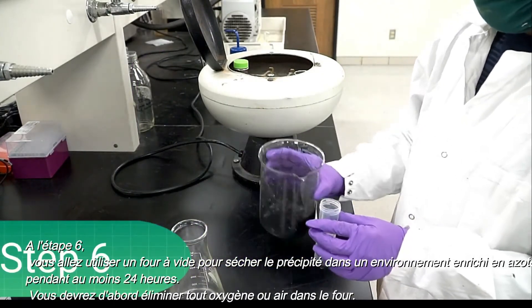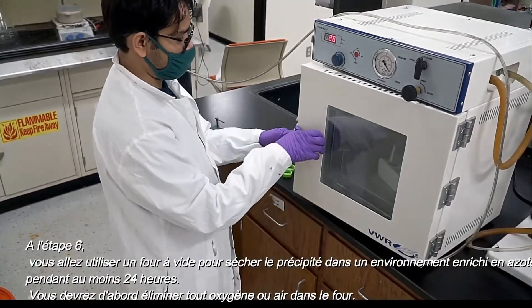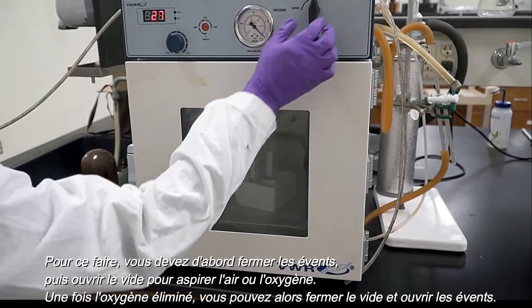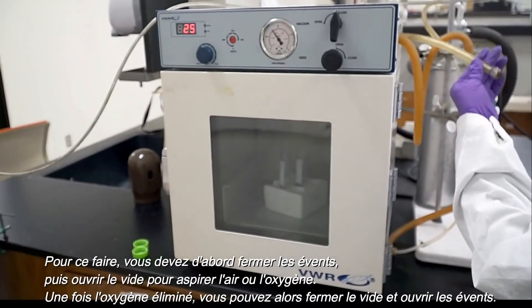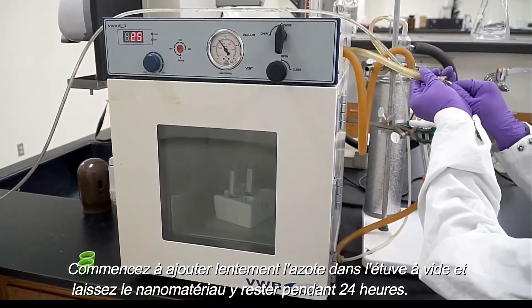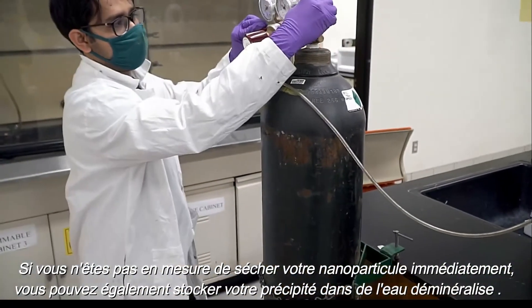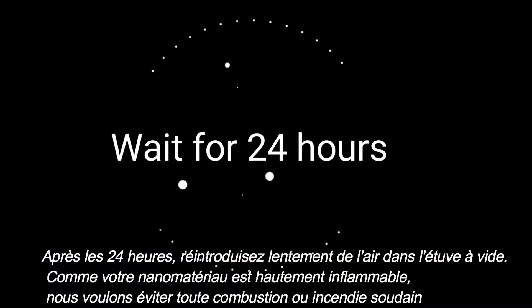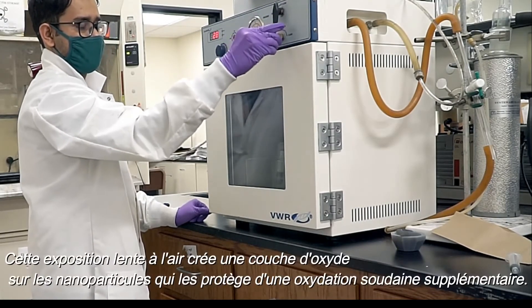Step 6: using a vacuum oven, you will dry your precipitate under a nitrogen-rich environment for at least 24 hours. You will first want to remove any oxygen that is present in your vacuum. To do this, you will close the vent and open the vacuum. Once the oxygen is removed, you can then close the vacuum and open the vents. Slowly start adding the nitrogen to your oven and allow the nanoparticles to sit in there for 24 hours. If you are unable to dry your nanoparticles immediately, you can also store your precipitate in DI water. After 24 hours, slowly allow air back into your vacuum oven. Because your nanomaterial is highly flammable, we want to prevent any sudden burning or fire. This slow exposure to air creates an oxide layer on the nanoparticles that protects them from further sudden oxidation.